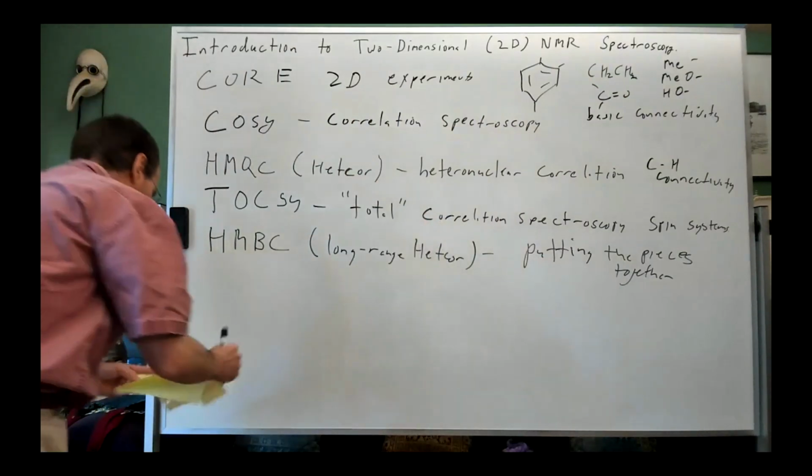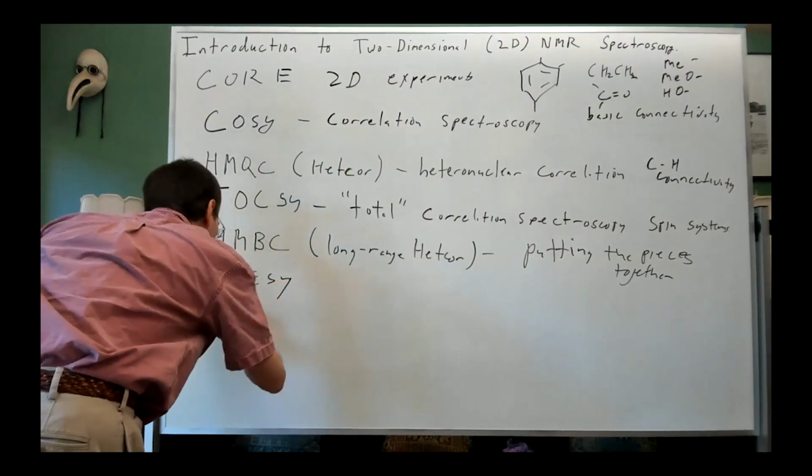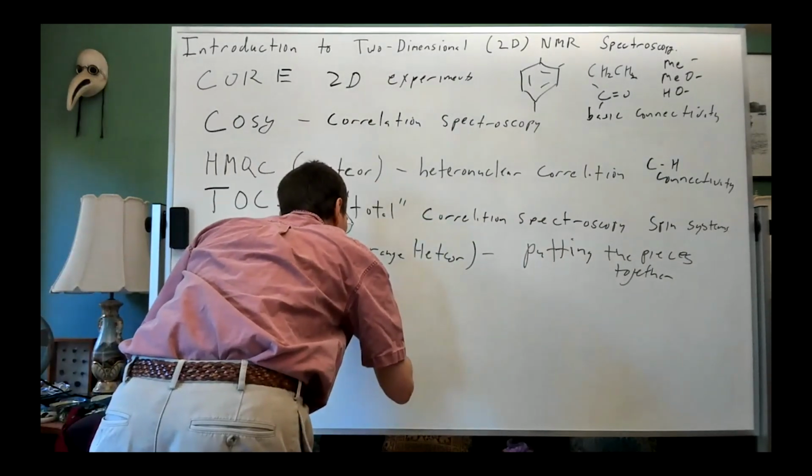Then two other experiments, NOESY and ROESY. These are two flavors of Overhauser effect experiments.